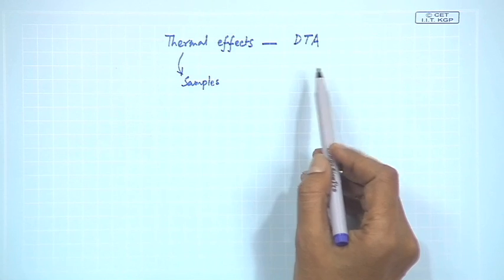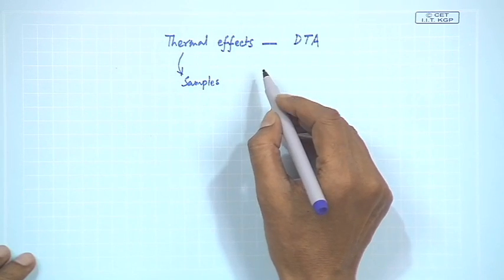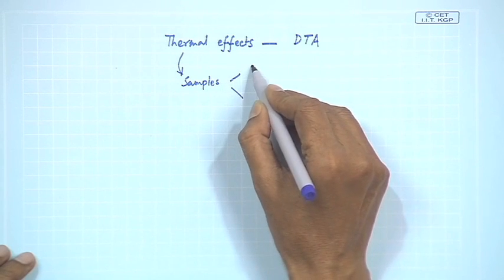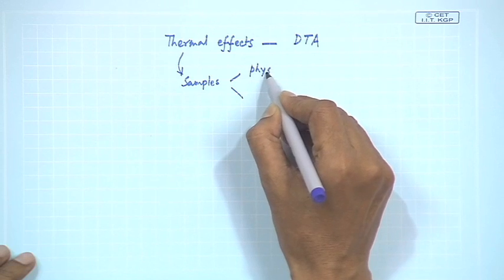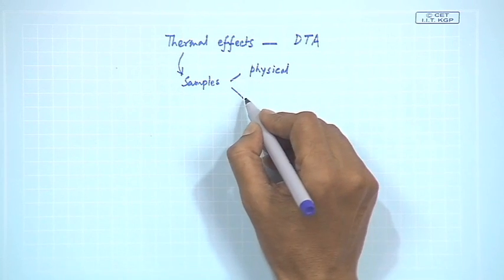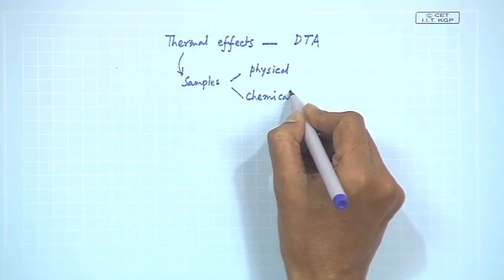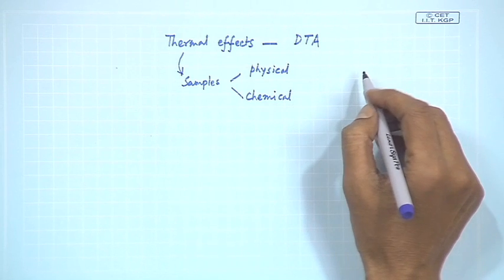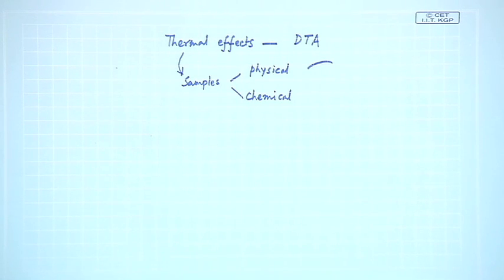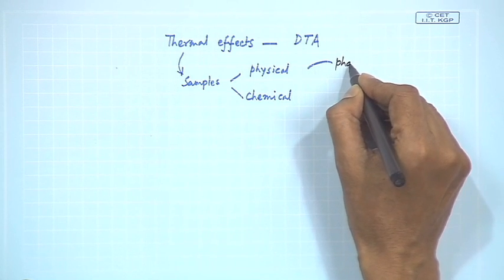So, that we will see now, because the different thermal effects or the heat effects on some sample can give rise to the different changes, which can be physical changes, or those can be chemical in nature, that means the chemical changes. Starting from a simple phase transition, what we all know that a solid sample can go for phase transition very well.